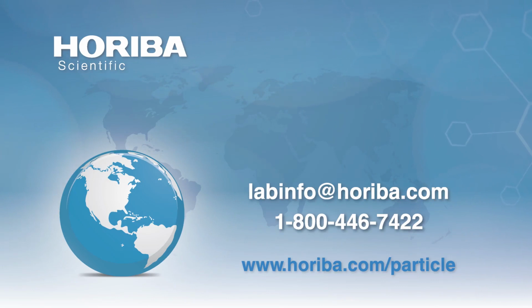There's no penetration depth per se, but it will depend on the process type, and certainly we wouldn't want an extremely bright light source on the other side of this transparent process chamber. But in reality, even if we had a bright light source there, we wouldn't see it, because if you're looking at something like fluid bed granulation or coating down within the bed region, nothing comes through from the other side. All we see is particles and more particles behind those particles, and so forth. So there's no contrast requirement except for very edge cases.